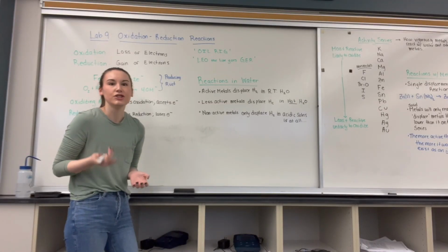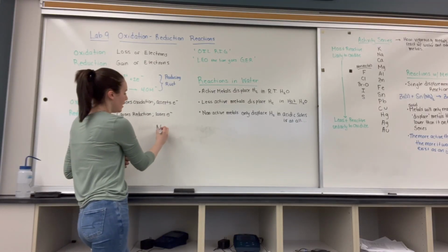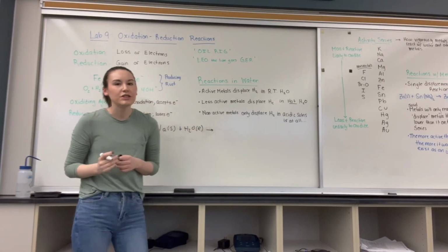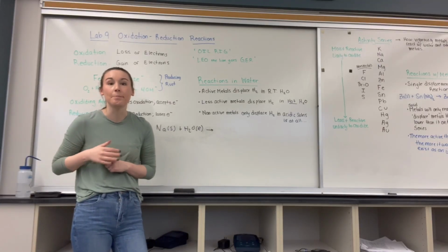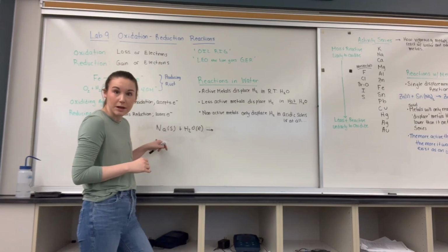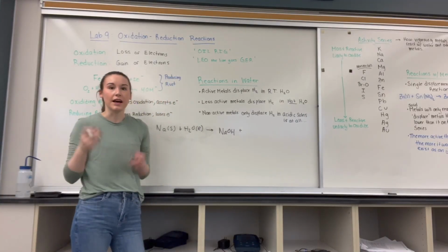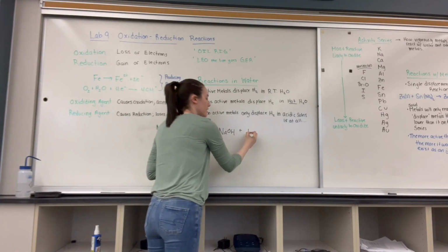When I'm reacting sodium with water, what's actually going on? Well, I'm taking sodium solid and mixing it with water, which is a liquid, and we saw that the phenolphthalein turned pink. Phenolphthalein turns pink because it's becoming a basic solution. What's a basic solution that you know that has sodium in it? Sodium hydroxide, NaOH. We also saw that a gas was released. It kind of looked like steam, and that's hydrogen gas.